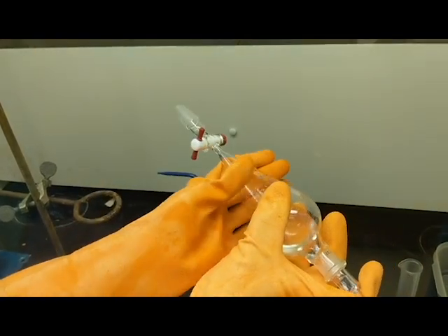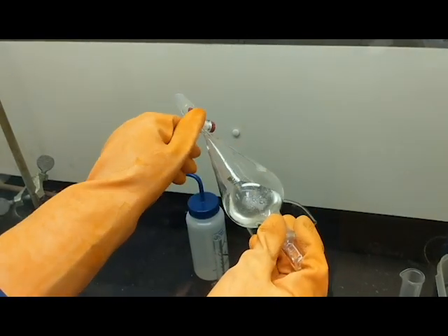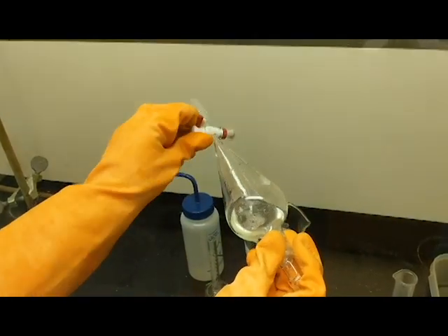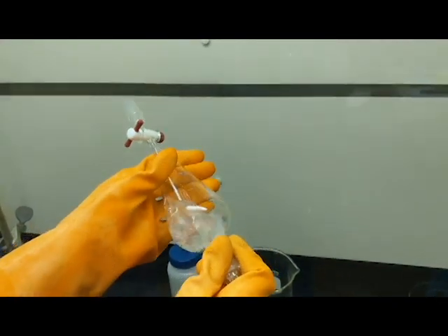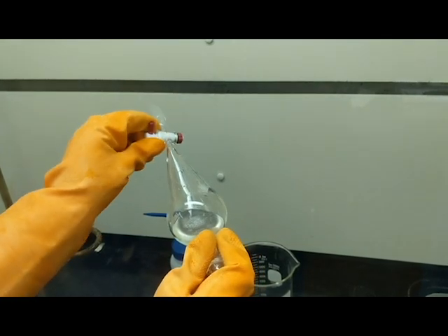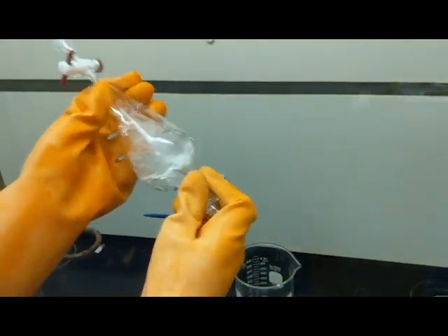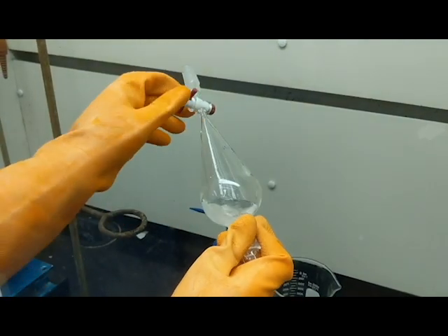You may not hear that hissing sound, but in lab you will. That hissing sound is your CO2 byproduct coming out. And notice that the solution is changing from clear and colorless to a more opaque, creamy white color.